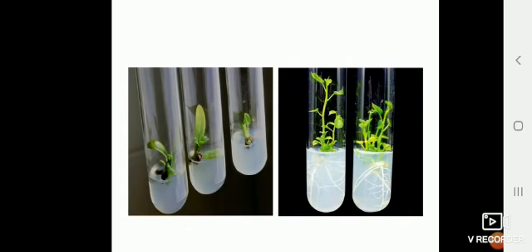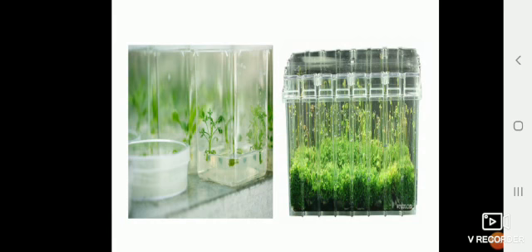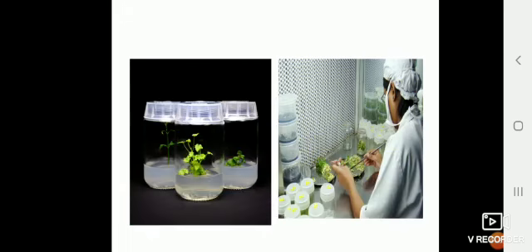These are some examples of plant tissue culture plants which grow under aseptic conditions in the plant tissue culture lab. These are the plants which grow in bottles. The next one is the explants being inoculated in a PTC chamber.